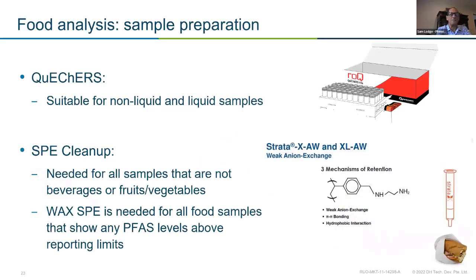So another matrix. This is getting kind of fun. Food is now a much bigger emphasis, actually much more so in Europe than in the United States. We're starting to see a lot of work being done on food, but nothing has really been promulgated, and none of the food companies are really doing this as a standard method. This uses a very unique process. It uses QuEChERS, which is a salt enhanced liquid partitioning, to isolate the samples.